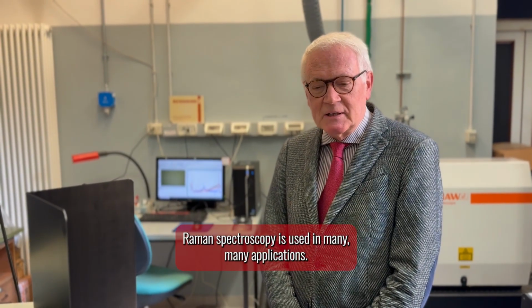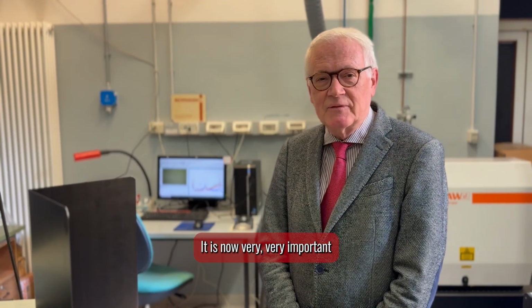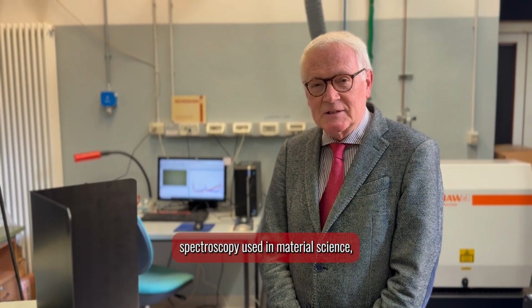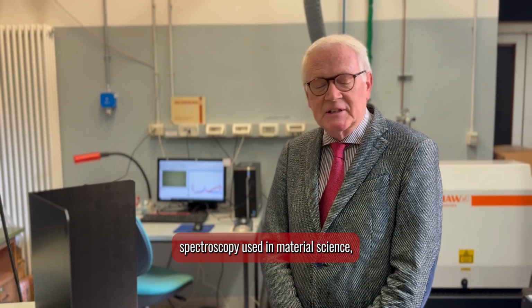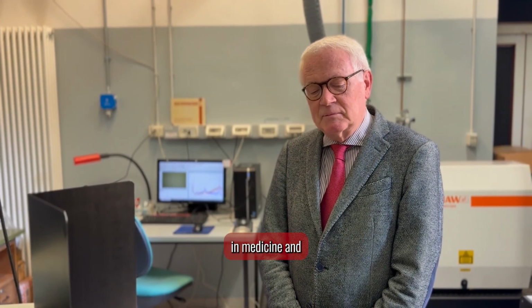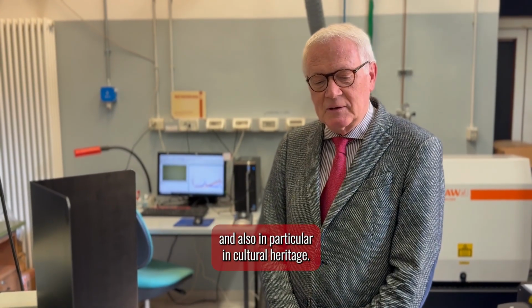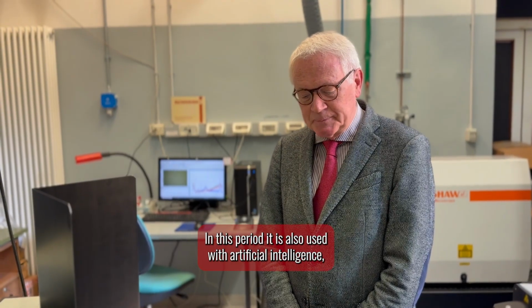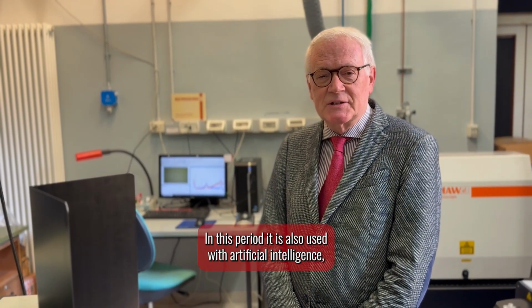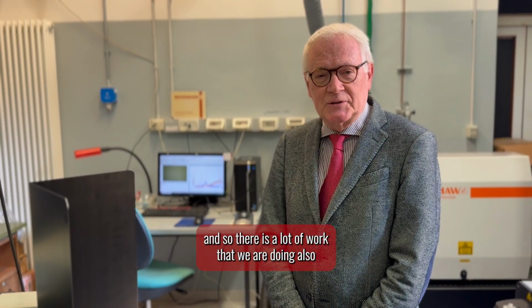Raman spectroscopy is used in many applications. It is now a very, very important spectroscopy used in material science, in medicine, in a lot of other fields, and also in particular in cultural heritage. In this period, it is also used with artificial intelligence, and so there is a lot of work that we are doing also with Raman spectroscopy.